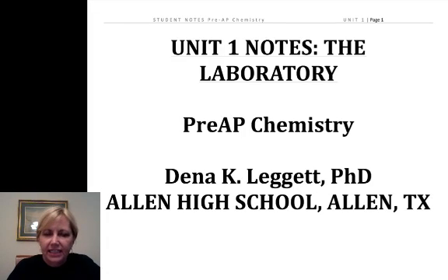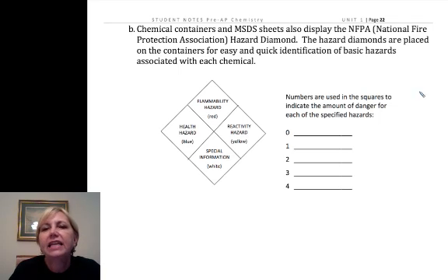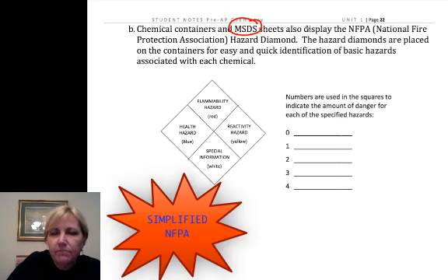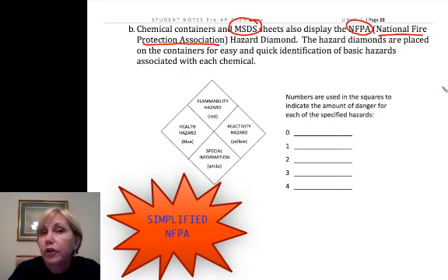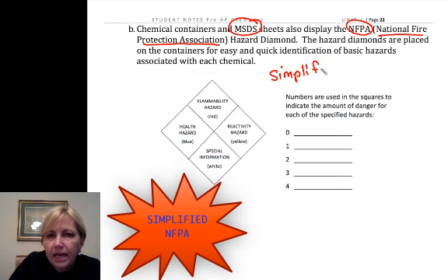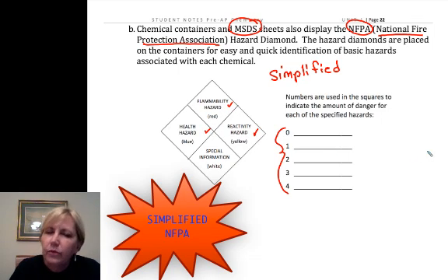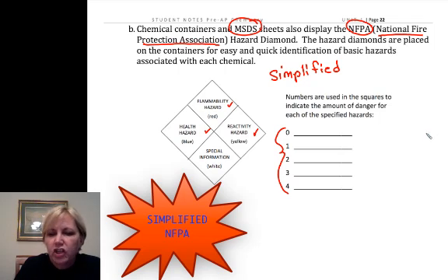Hi and welcome to Allen High School. We're talking about lab chemicals and chemical safety. There are a couple of ways that chemical safety is communicated. We're going to talk about an MSDS sheet, but these MSDS sheets often show something very similar to an NFPA diamond. NFPA stands for National Fire Protection Association, and they've developed this diamond that gives us a very quick look at the hazards a chemical may have. We're going to give you a simplified version, just to give you the broad general at-a-glance idea.